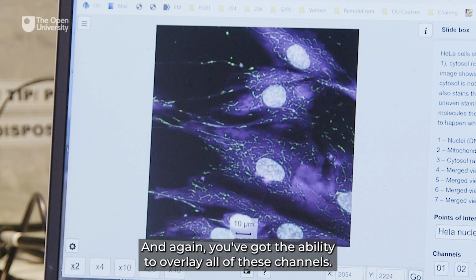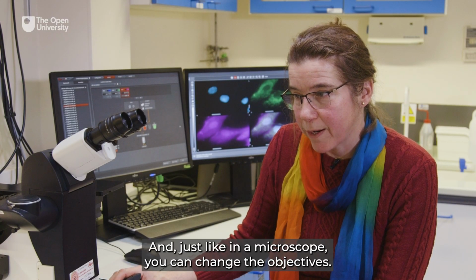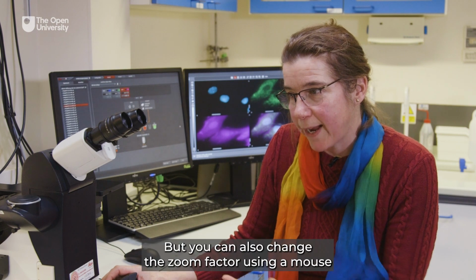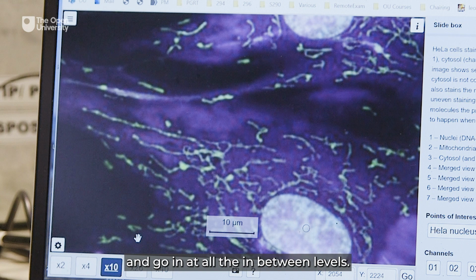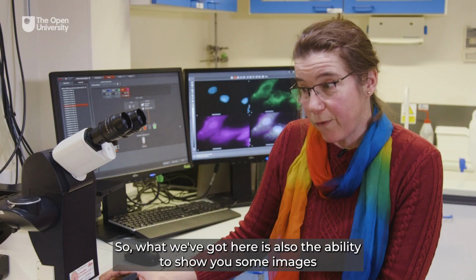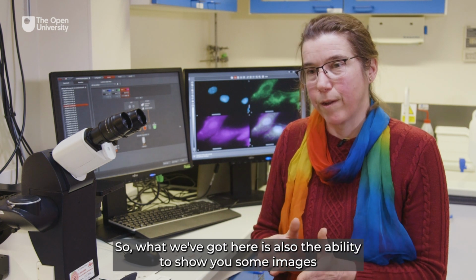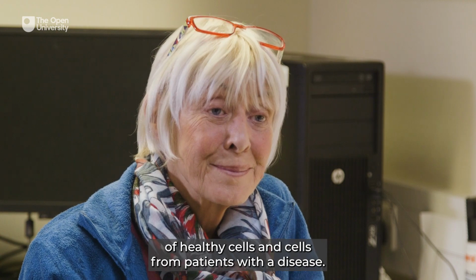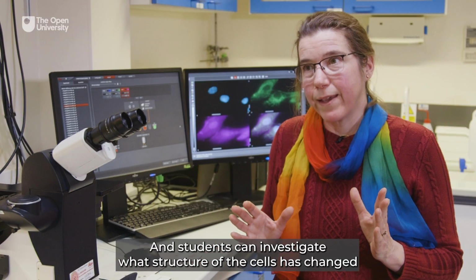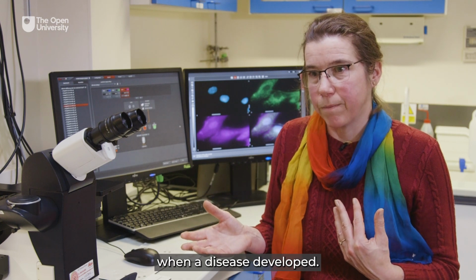And again, you've got the ability to overlay all of these channels. Just like in a microscope, you can change the objectives, but you can also change the zoom factor using a mouse and go in at all the in-between levels. We also have images of healthy cells and cells from patients with a disease, and students can investigate what structure of the cells has changed when a disease developed.